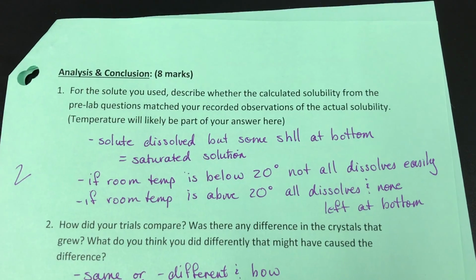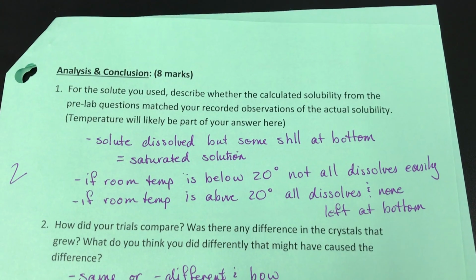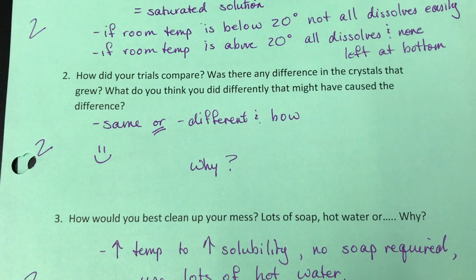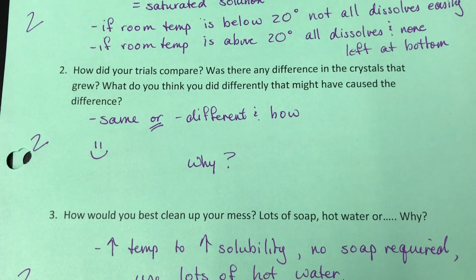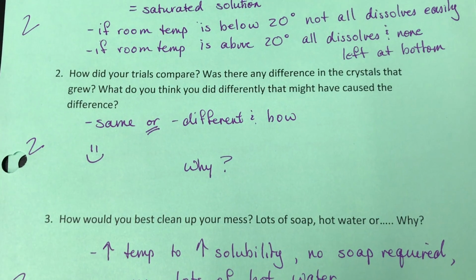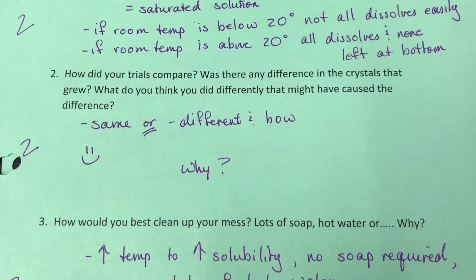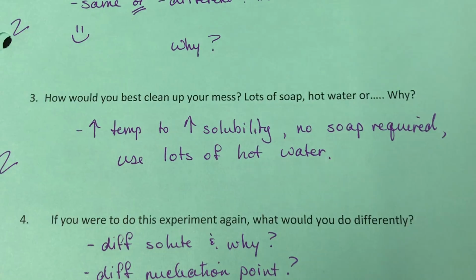For mine, I did make a saturated solution, but I think I overshot the mark with adding as much solute as I had calculated. For number 2, it had asked you to do multiple trials, and I think doing this twice is a lot. You might have to reboil yours, so you could reflect on that. You could also compare your solution to the ones that I just showed you, rather than doing this all twice. And you might be able to hypothesize what caused the difference in what you would see.